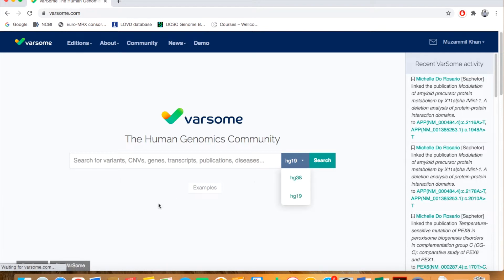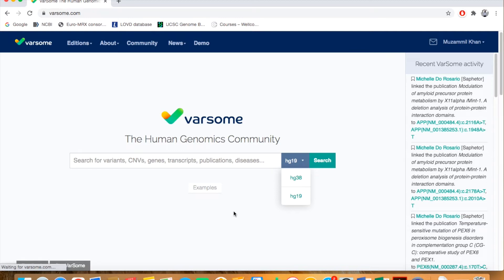You have different options through which you can give the variant information. If you want to know which format you can use and in how many different ways you can provide the information—the RNA variant, the protein variant, or the genomic variant.